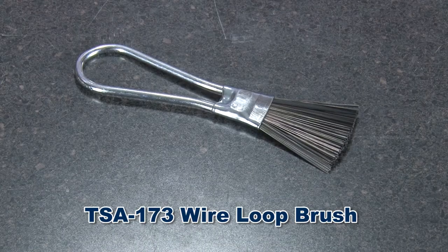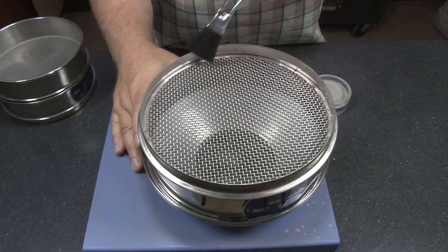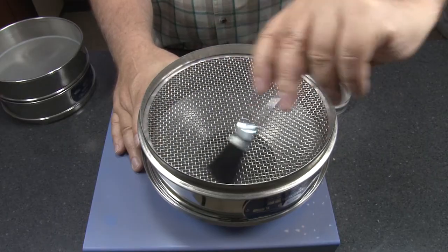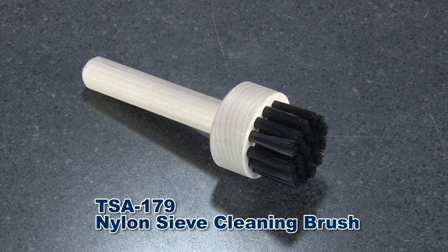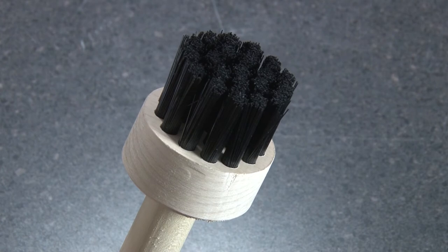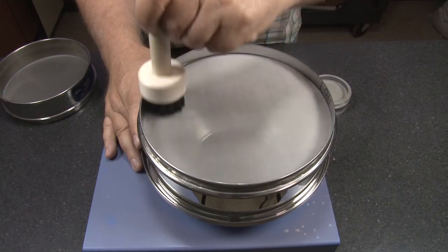The TSA 173 wire loop brush is a one and a quarter inch wide fan type brush with long metal bristles, designed for use on coarse wire cloth. Gilson's TSA 179 nylon sieve cleaning brush has a three and three quarter inch hardwood handle and thick nylon bristles, and is best for cleaning 120 mesh and finer test sieves.